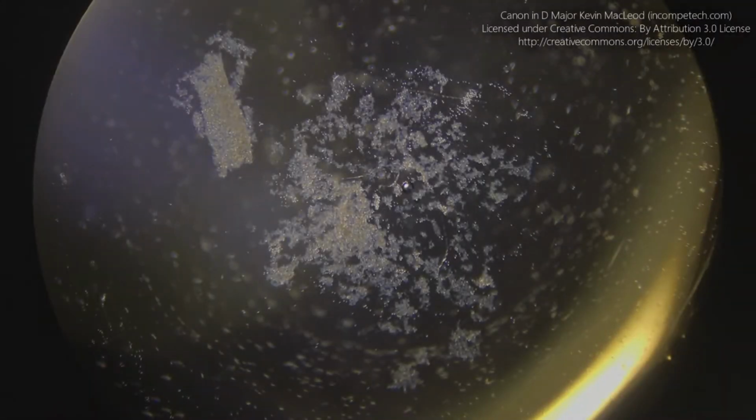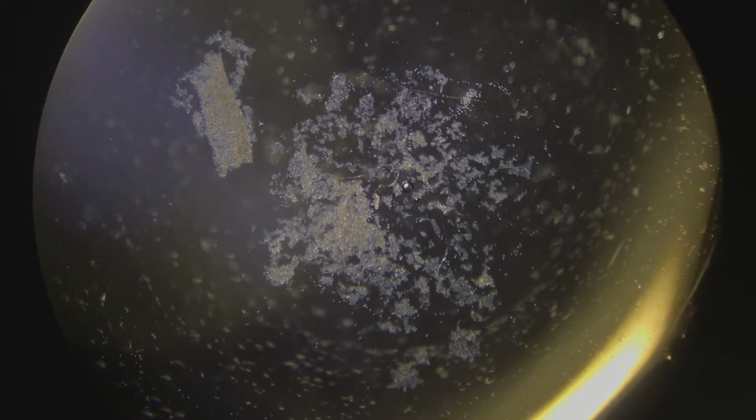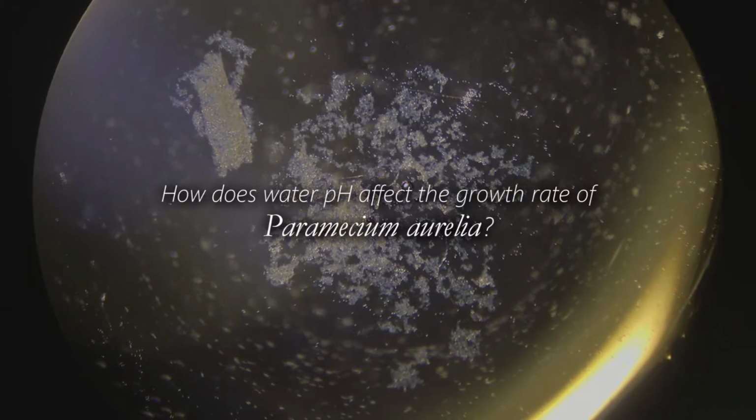Hello, I'm Dr. Aden Eagle, and together with my lab partner Dr. Thi-han, we investigated this age-old question. How does water pH affect the growth rate of Paramecium aurelia?